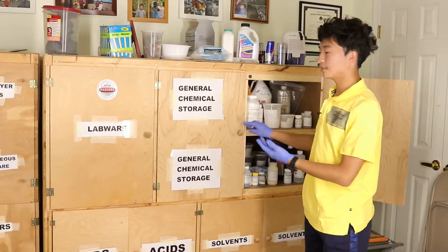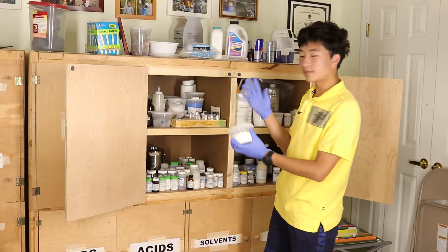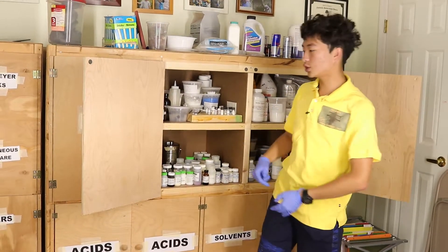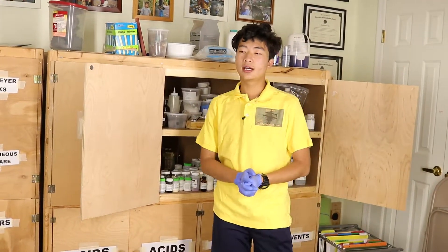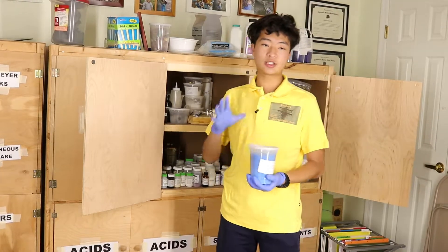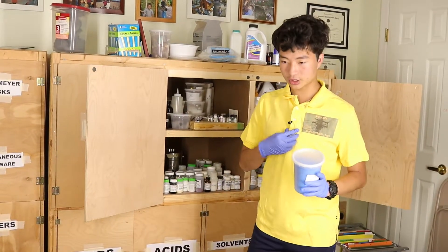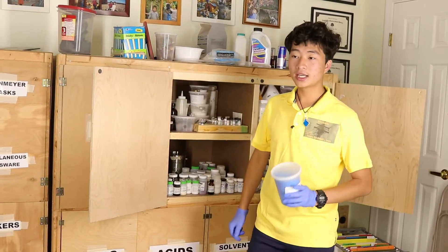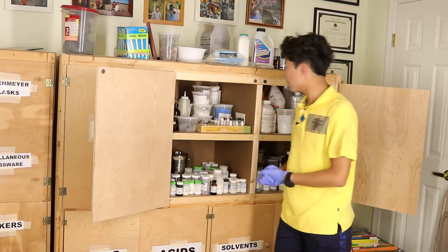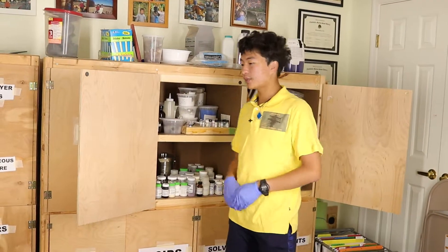Moving on to general chemical storage — you can see some of my Chinese takeout containers here. This is sucrose, which is table sugar. Over the years working with limited budgets and limited availability, I've learned which chemicals you can find in stores. I found copper sulfate pentahydrate — spent about five bucks for the whole thing, sold as root killer at Home Depot. It's great for growing crystals, like the copper sulfate crystal I have around my neck, and for ion exchange experiments. I also have desiccants and salts like ammonium chloride in the back.